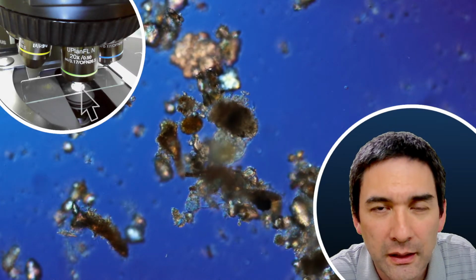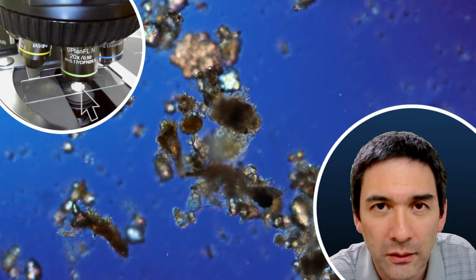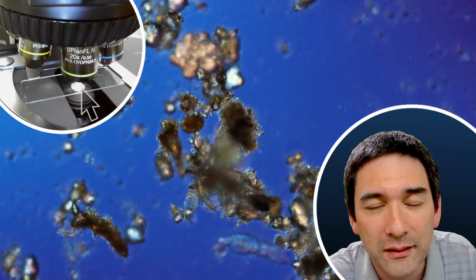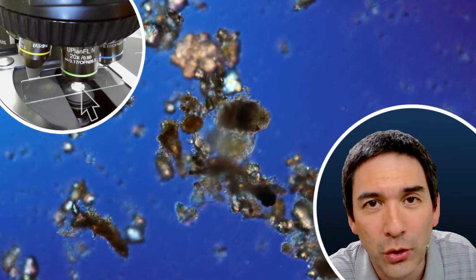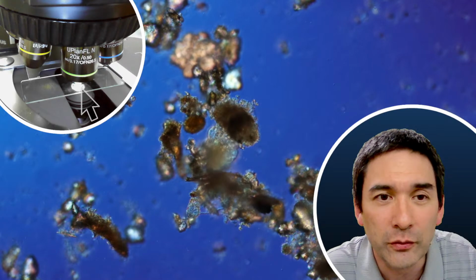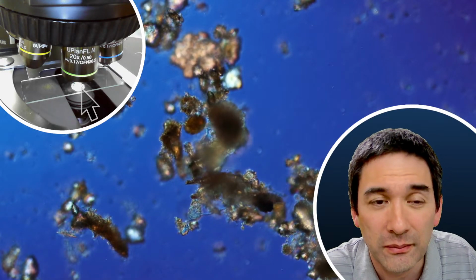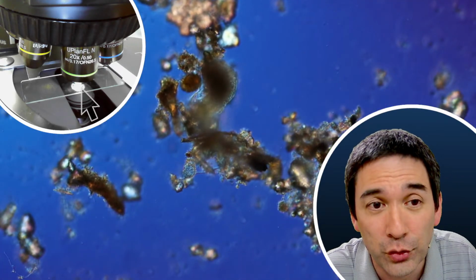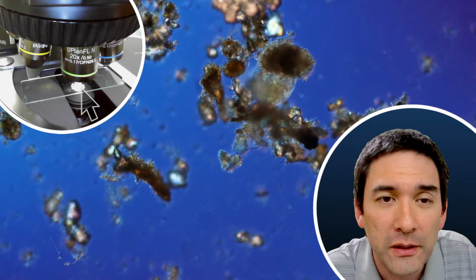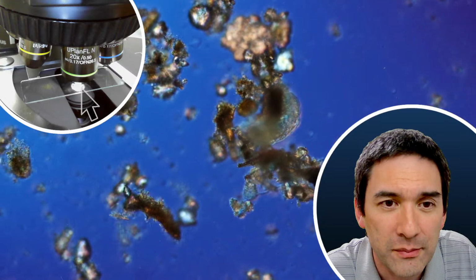But generally, if you just take pure tap water, out of the bottle, and put it directly under the microscope, you're not going to see anything, because drinking water and even tap water, even if it's not for drinking, is generally too clean for you to see microorganisms.